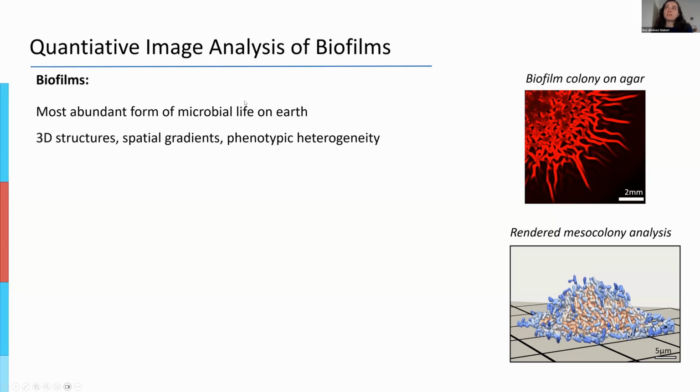To get started, I'm going to start with the reason why we developed BiofilmQ in the first place, which is that in our lab, we are interested in looking at biofilms. And biofilms are three-dimensional microbial communities. They are the most abundant form of microbial life on Earth. That alone makes them very interesting, but they are three-dimensional and very tricky to analyze with conventional software.